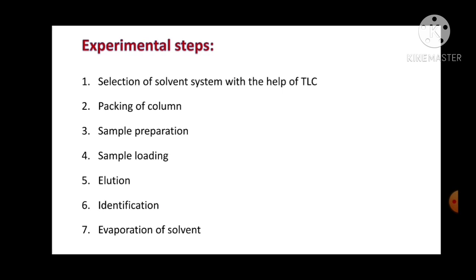In this case the sample is visible — it is a colored sample of red and blue ink — so we can easily see where the sample is and collect fractions in test tubes. If the sample is invisible, we can use UV light: whatever fractions are eluting, we spot them on TLC and compare with the mixture. When they match, we collect those fractions and evaporate the solvent.